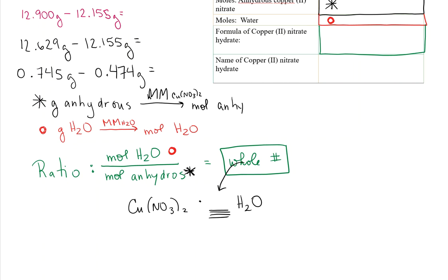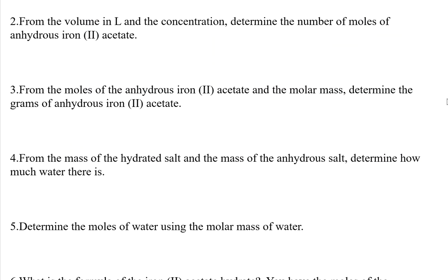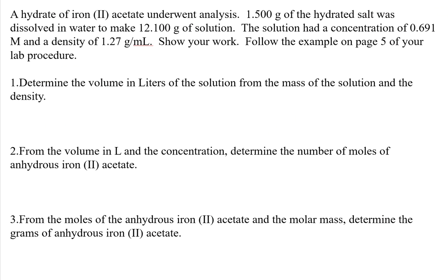All right, that's the first part. So you're going to take it, drive off the water, figure out how many moles of water are formed, and then go from there. The next part is much trickier. So I'm going to walk through this with you again and show you what you need to do.